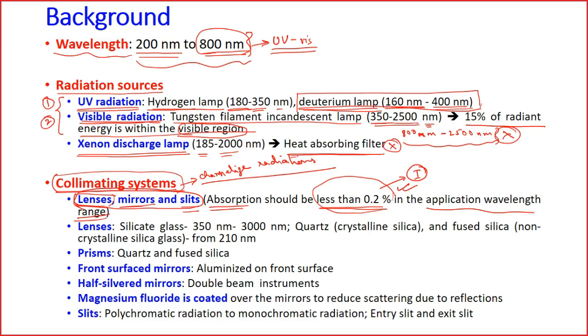Secondly, if something is getting absorbed within a particular system, suppose I have a matter over here and I am continuously bombarding it with a particular radiation, and this matter is absorbing this radiation, then what will happen? Over a period of time, the temperature of this matter will increase.